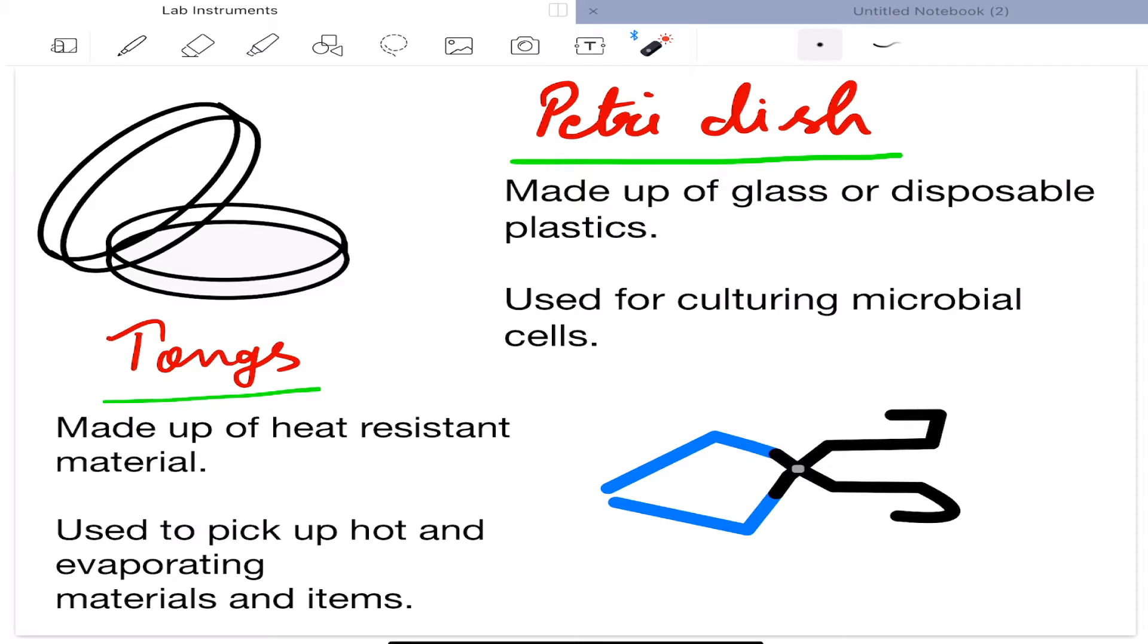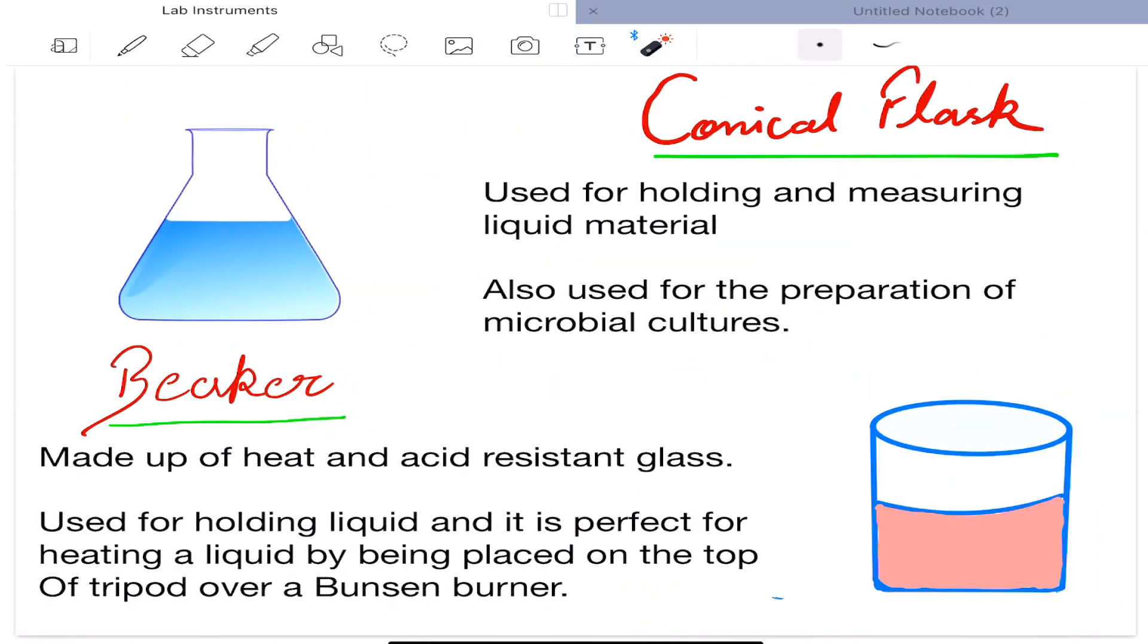It is made up of glass or disposable plastic. It is used for culturing microbial cells. Next is tongs. Tongs is made up of heat-resistant material. It is used to pick up hot and evaporating materials and items. Next is conical flask. Conical flask is used for holding and measuring liquid material. It is also used for the preparation of microbial cultures.